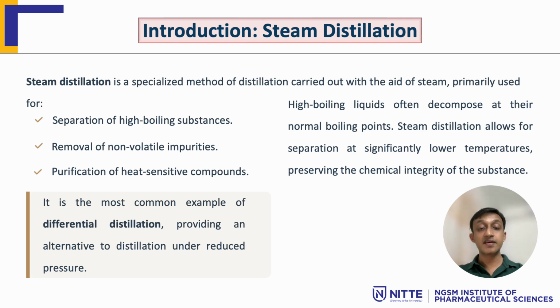This makes it especially useful for extraction of volatile oils, purification of heat sensitive compounds, removal of non volatile impurities, and it is considered a type of differential distillation and it provides an effective alternative to vacuum distillation in many cases.